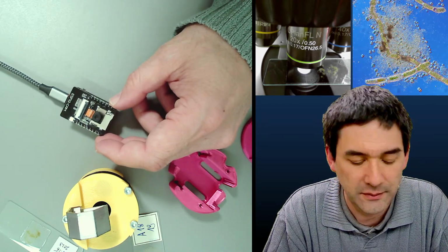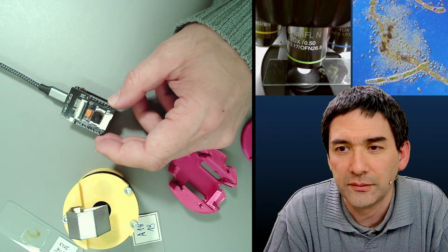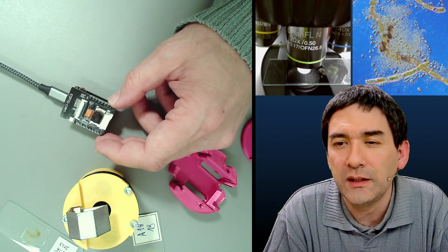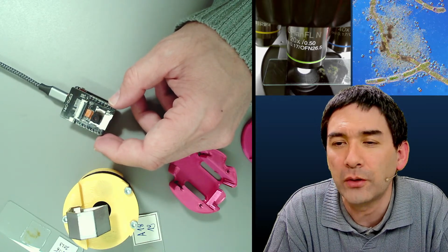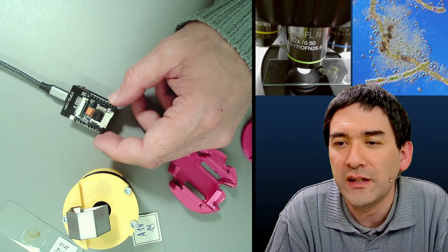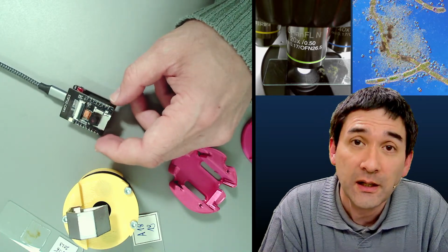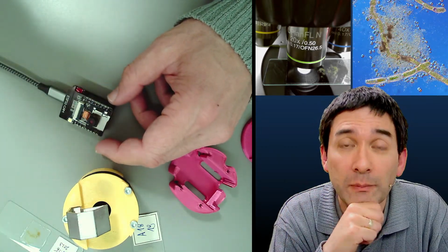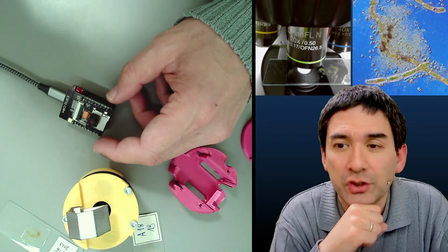So let me see, it takes a minute or so. I'm just seeing that there is a comment here, the most recent comment. I've been thinking, basically, we all have smartphones with cameras, right? So wouldn't it make sense to have something similar where you insert your camera phone with a flash as a light source? As a matter of fact, there are projects like this where you can connect a lens in front of your mobile phone camera.